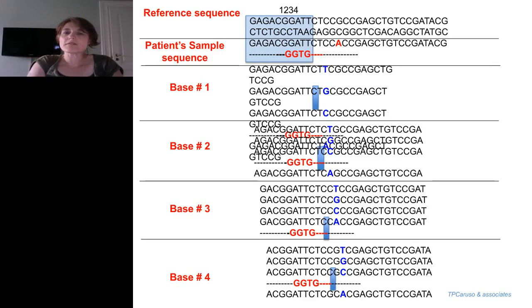The problems arise when there is a mutation, and after that mutation is passed, then there is a mismatch to the left of your 13th base. So if you imagine just single base substitutions, that's usually not a big problem, and that can be overcome pretty easily with the hybridization conditions.